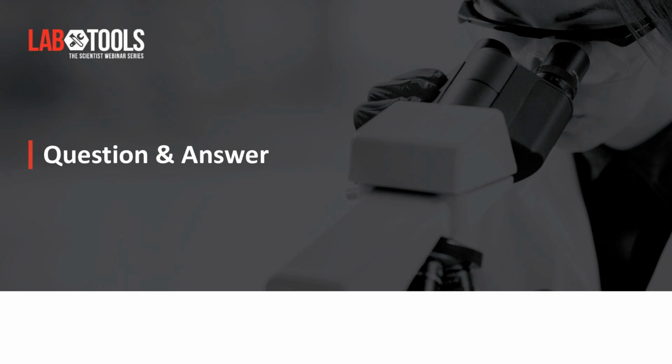And I think we just want to wrap up with one final question. A couple of people are asking if you could provide some numbers in terms of how much oligos cost per synthesized base pair, and also how much quantity you get from the service. Okay, so about the price, it starts from 11 cents the base. However, it will increase above 120, and with the complexity of the sequence, it can be more. In terms of quantity, the amount of DNA that you get will be 50 picomole, something like that, and you get it in 20 to 25 microliters. 50 is the minimum guaranteed.